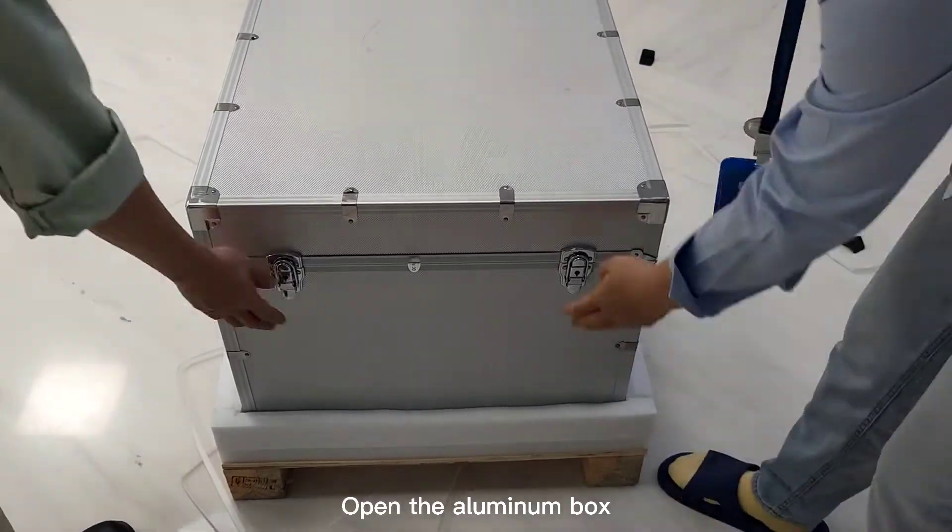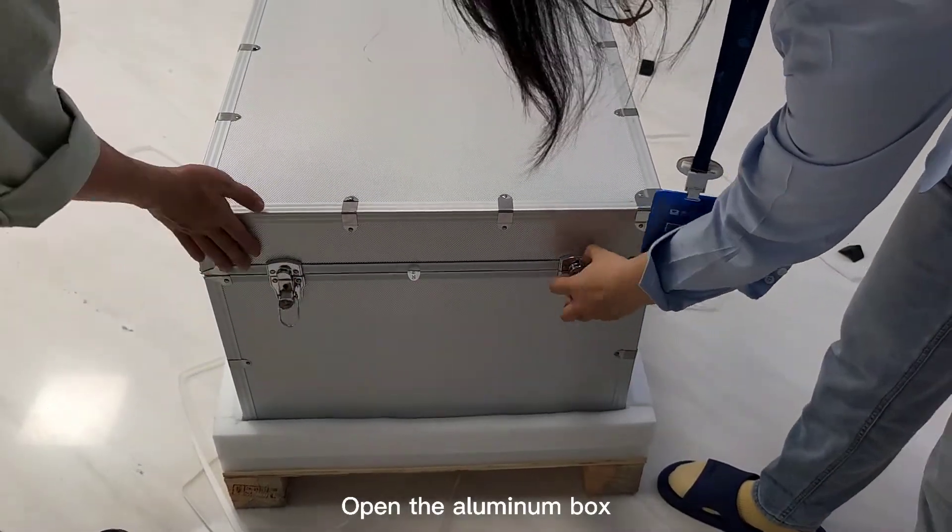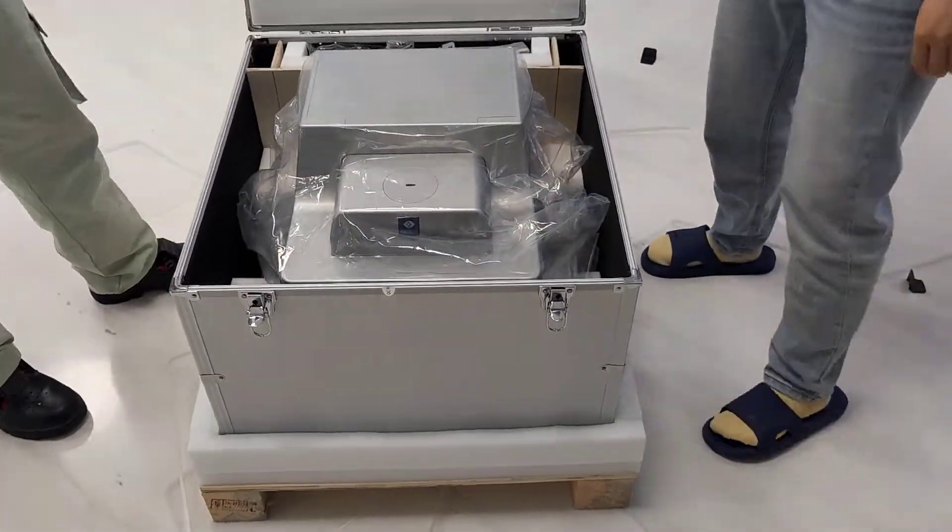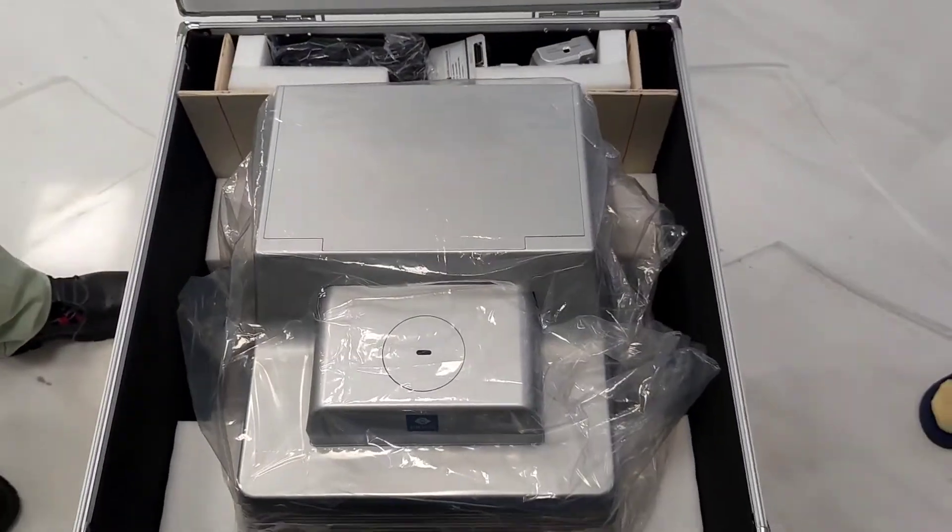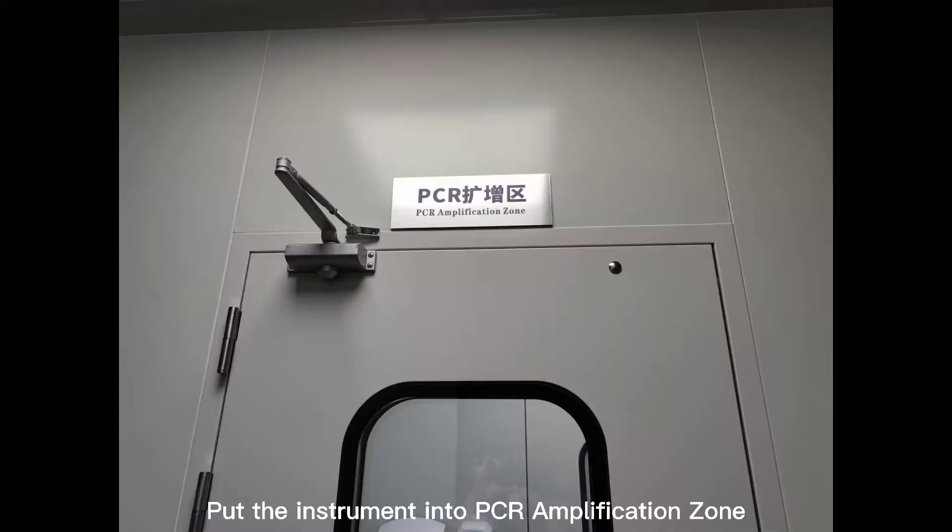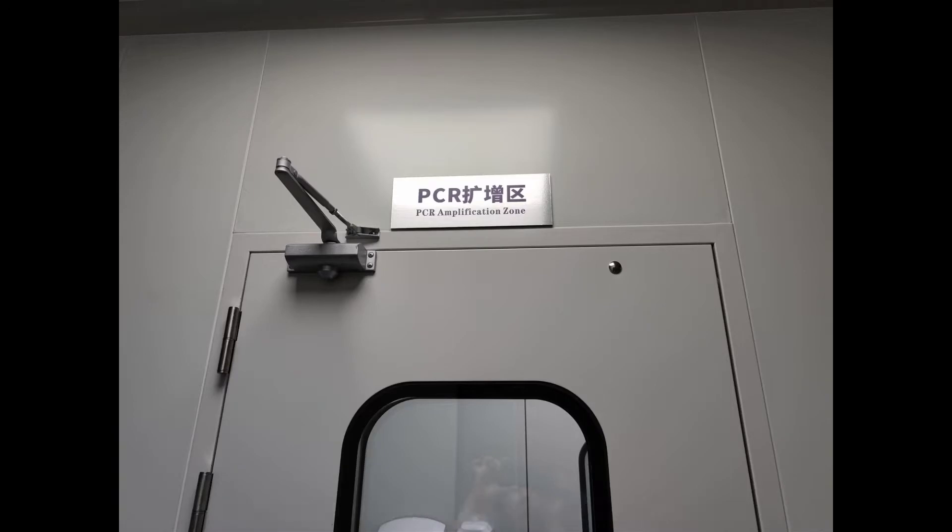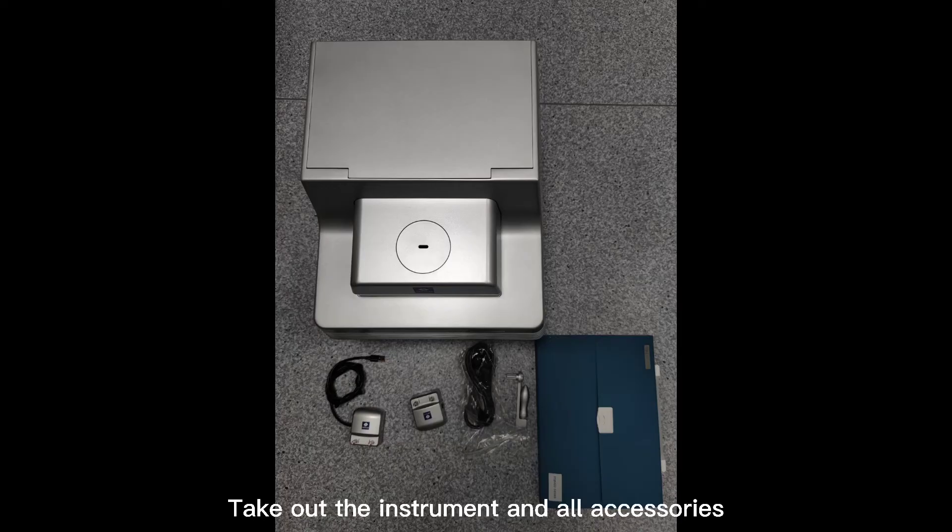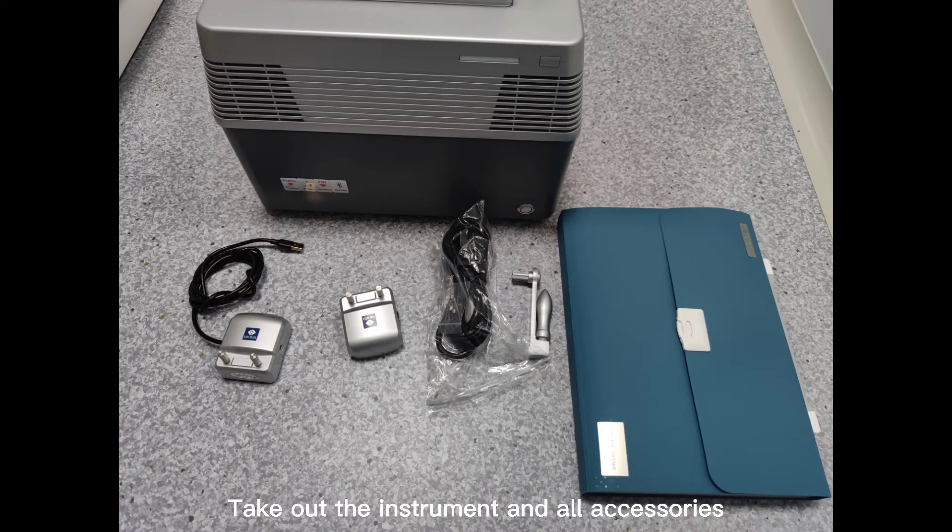Open the aluminum box. Pull the instrument into PCR amplification zone. Take out the instrument and all accessories.